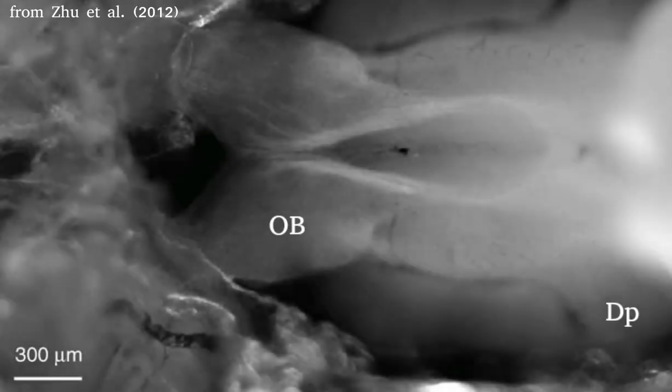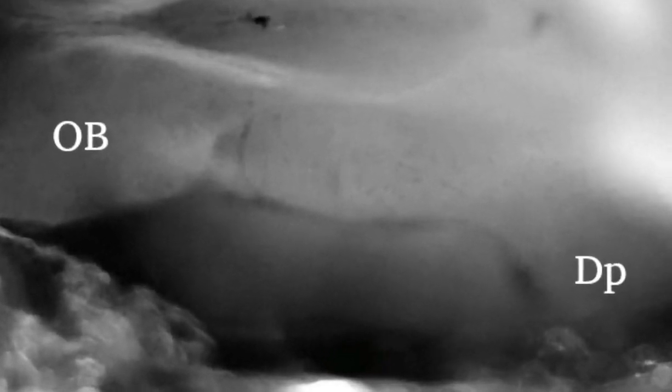In this ex vivo preparation, the brain is exposed from its ventral side. The nose and the olfactory nerve remain intact. It is crucial to remove the dura covering DP to prevent clogging of the pipette.